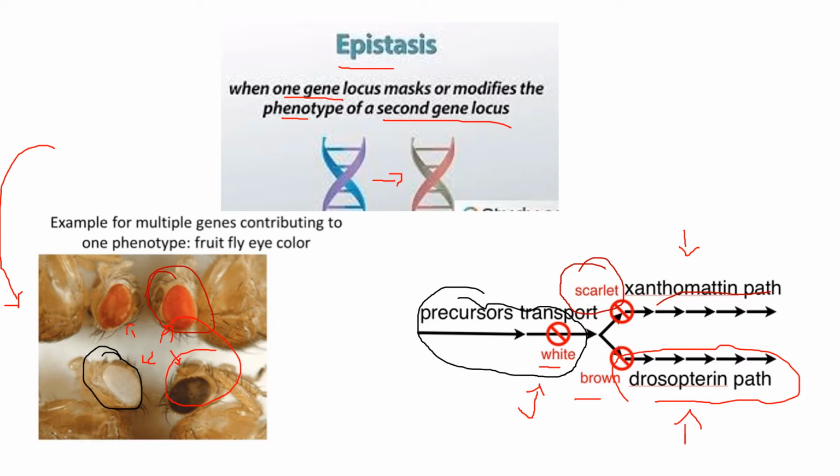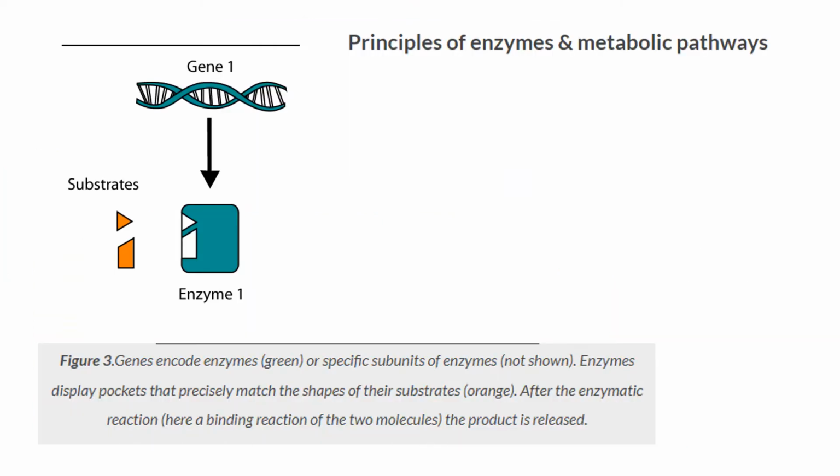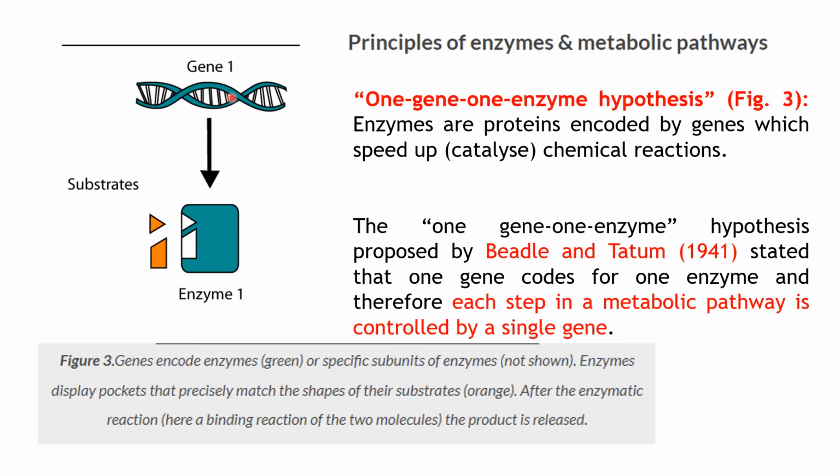So how we're going to do it? Let me explain very quickly. If you remember, we are testing this thing that you have studied in chemistry and biology, this idea of one gene, one enzyme, that I don't need to talk a lot about, but remember to study the work of Beadle and Tatum. In particular, in a biological system, we wish it was so simple.